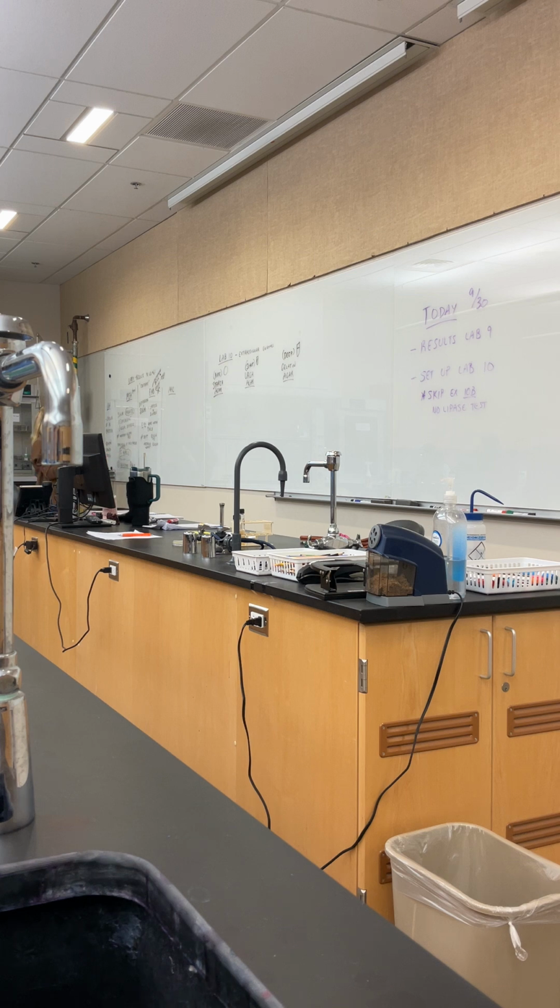All right. What's going to make it selective is going to be the presence of the dyes. The dyes, the eosin and the methylene blue, which is going to kill off any gram positives. Okay? So it's going to kill all gram positives. So with this in mind then, if I have any coliform on this, they will grow. If I see metallic, that means E. coli. If they're growing and they're not metallic, that means a different background coliform.